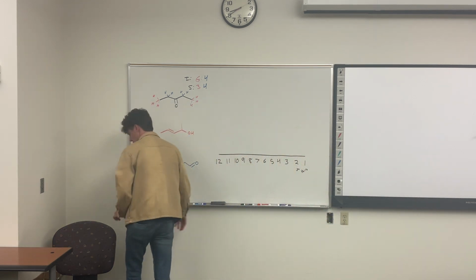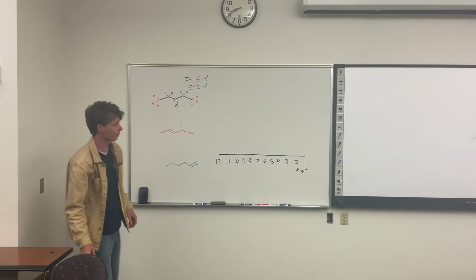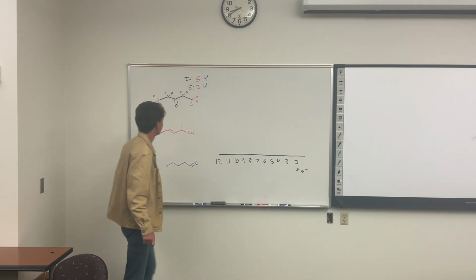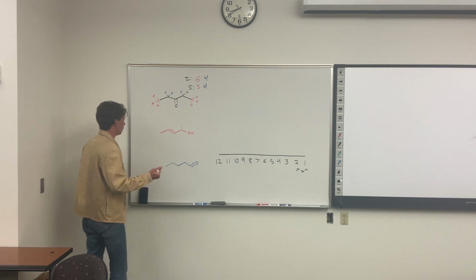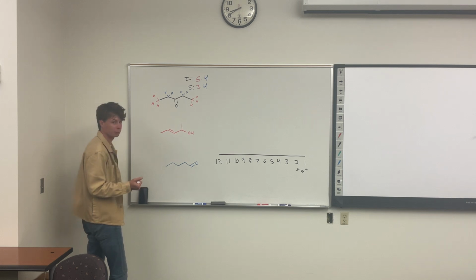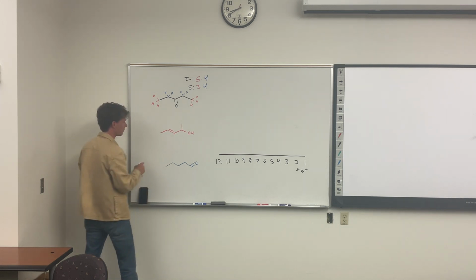Here's an example of an alkene and an alcohol, both of which will have their own spot down here, which I don't know because I don't have it memorized, but I have my phone on me to check. Let's start. I shouldn't expect any symmetry in this molecule, so we're going to expect a lot of signals. Notice each group of hydrogens should be chemically different.